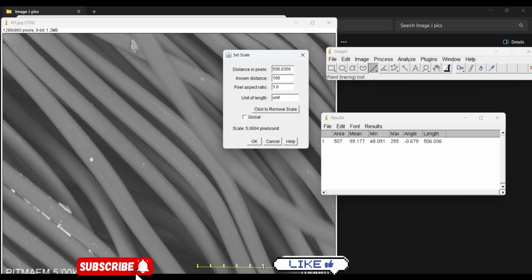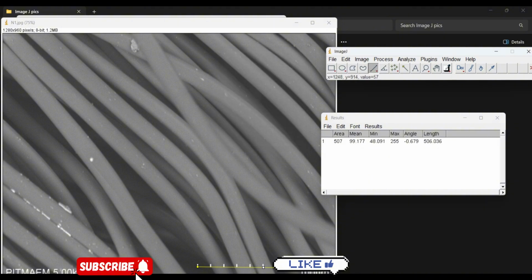We have to tell the software that these 506 pixels are 100 micrometers. So this distance is 100 and the unit is, you can type U and M here. Before clicking OK, let's take a few more measurements as there are human errors. Let's take 5 measurements and take the average.